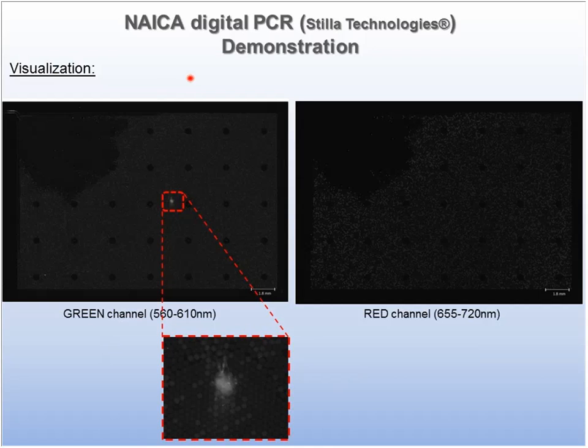So you have here an example of artifact. It's a photograph here in the green channel. We do not observe positive droplets, except in this area in which we observe a big area, a big white artifact. And you have here an enlargement. You see that it does not correspond to droplets.